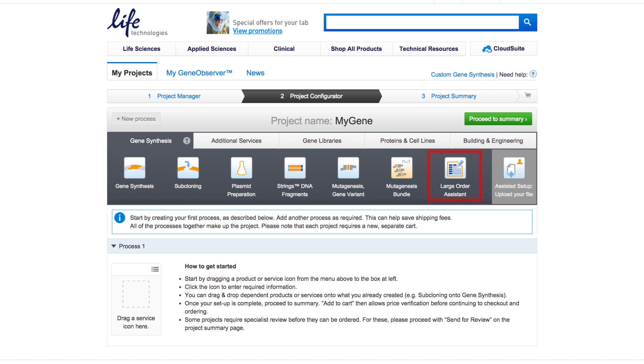This includes optional optimization for maximum protein expression. This large order tool is ideal for projects with larger numbers of constructs or multiple projects with identical needs like subcloning and cloning sites. The Assistant supports tabular data input, which will get transformed into the standard icon view in the end.